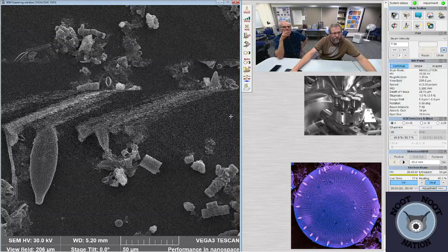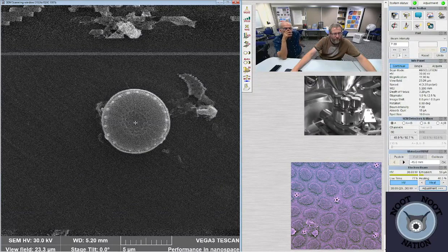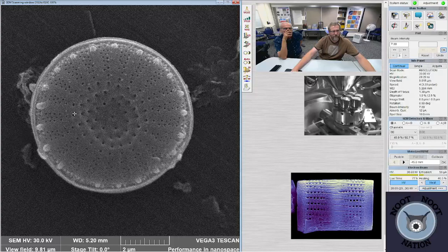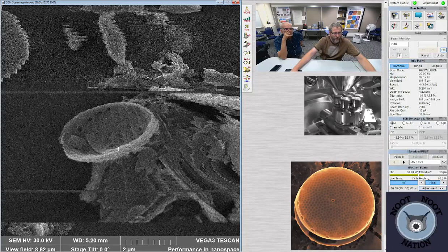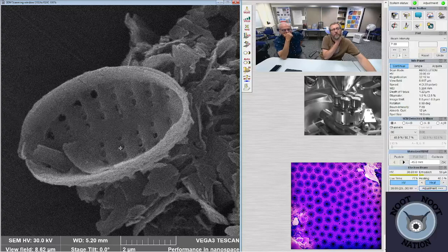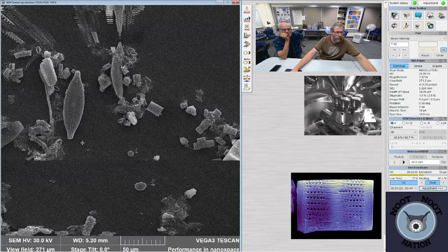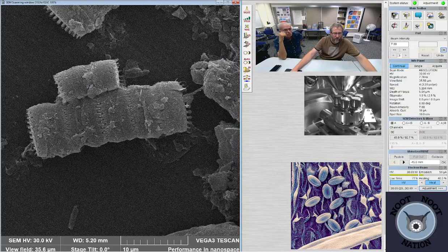What are those small round things, small oval things? These ones? Yeah. Well, that's a diatom. It's Stephanodiscus. Minutulus? Something in that group. It's not quite Minutulus, though. That's a Stephanodiscus. These ones? Yeah. It's Staurosira. Not sure about the species. They're the same as these ones. They're all laying on their sides.